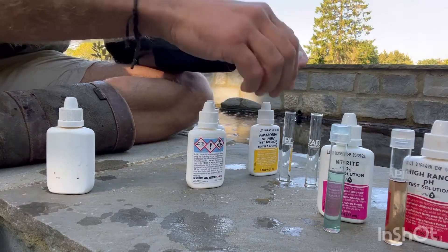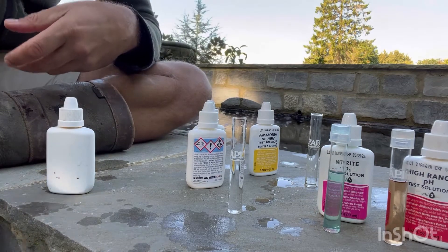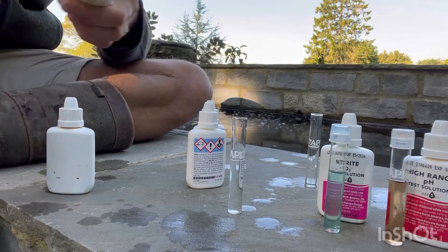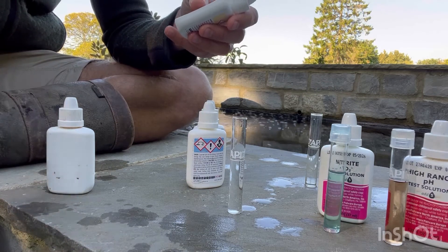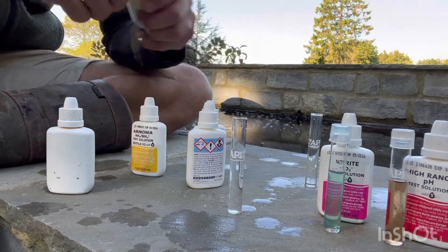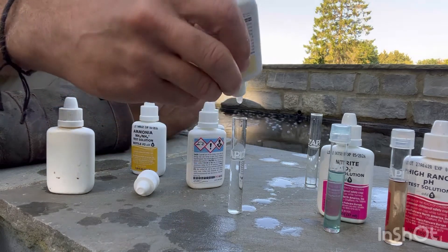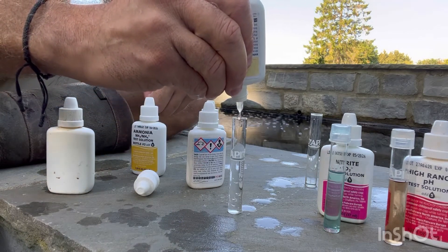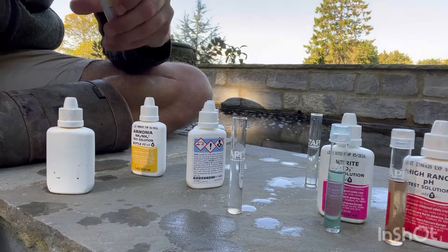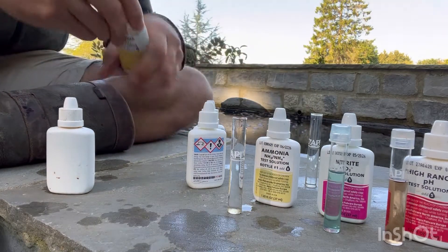Ammonia next. This is a two-bottle one. Bottle one, add eight drops. The second one — I know you've got to shake it for about a minute, I'll do that now, just skip that part of the video. So eight drops of bottle one, then eight drops of bottle two. You just apply a little bit of pressure — it starts coming out, then maintain that pressure so you can ensure you get the same size drops.